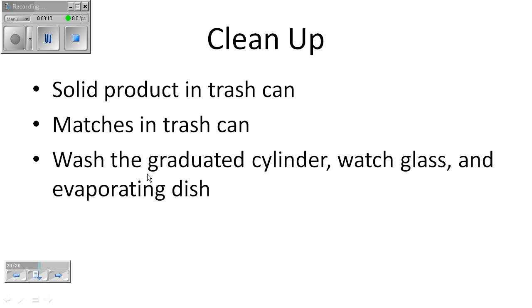Okay, and at this point, we're ready to clean up. This solid product that's in your evaporating dish will go in the trash can, along with any matches that you've used. Do not put this tin and oxygen product in the sink. It does not dissolve in water, and it will not rinse down the sink. And then after you're finished, and along the way you may have done some of this anyway, you wash the graduated cylinder out. It has nitric acid. Be careful of that. Wash off the watch glass, and then rinse out the evaporating dish, and you will be all done. Now, remember, at the time when you're done with this lab, you will have only made 3 measurements, and everything else that's on the data table is something that you calculate. Notice the headings in the data table.